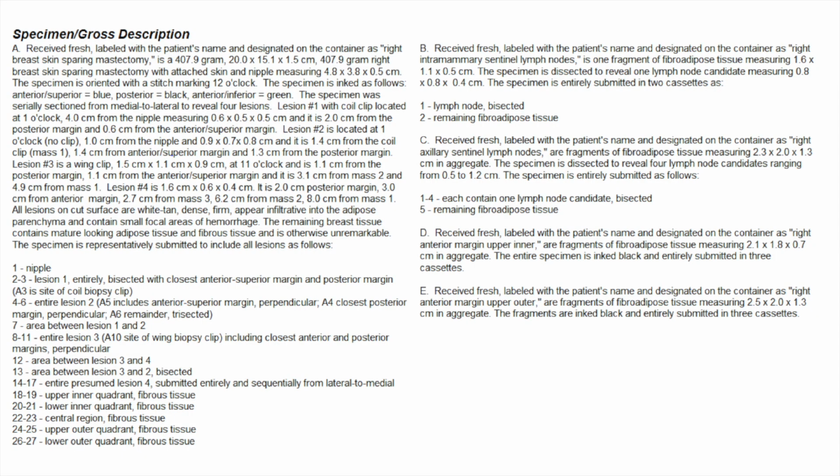Here again is the final gross description for this specimen. You can see we submitted representative skin and nipple, all 4 lesions with margins, areas between the lesions, and random representative quadrants and central breast tissue.